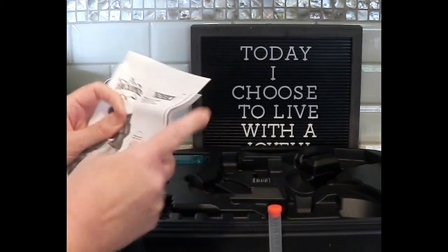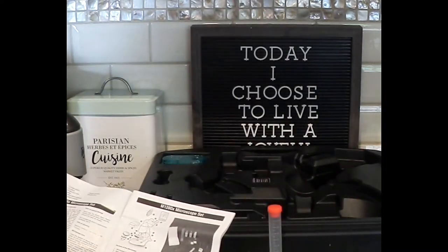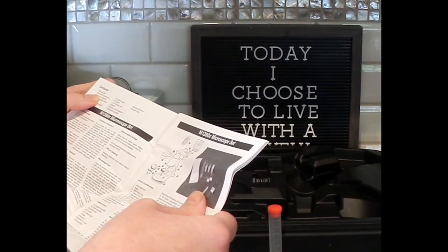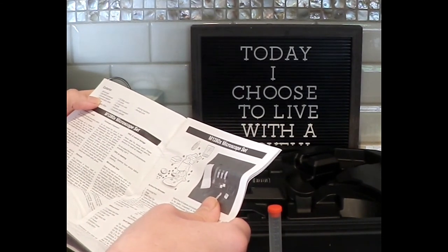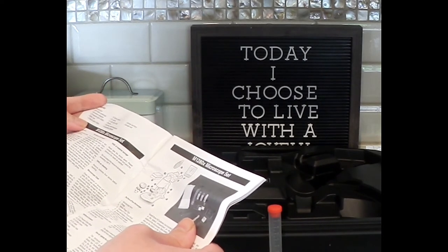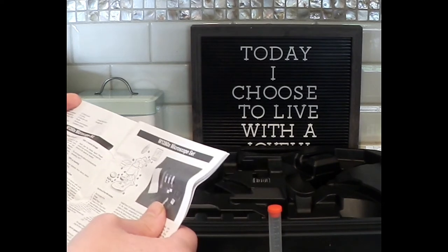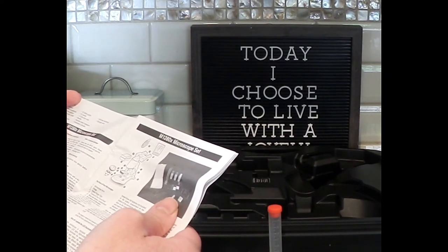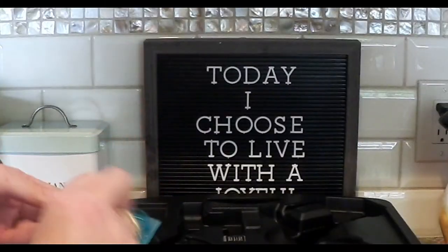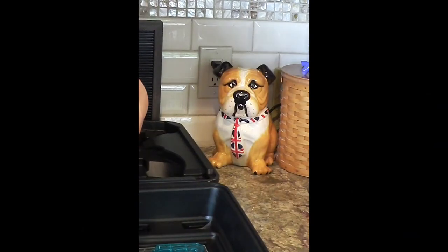We have the instruction manual here. So the contents are: the microscope, the dark field condenser, the cell phone adapter, three prepared glass slides, a slide case, 10 blank glass slides, 10 slide covers, 10 labels, three collection vials, a pipette, stainless steel tweezers, a graduated cylinder, a shrimp hatchery, and a storage case. And these are the slide covers.